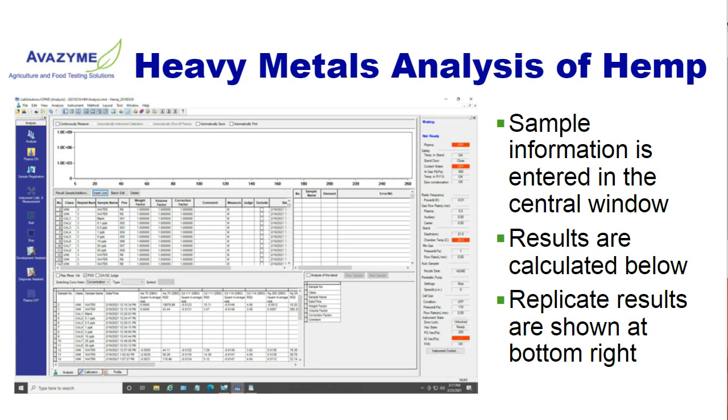That will be volumes and weights and all of those things, which are used to compile the data, which is actively calculated in the lower center frame. To the right of that is the individual data. In our case, we replicate 3 runs of the data, and so all 3 individual replicates are shown to the right, and the average is shown in the left frame there.